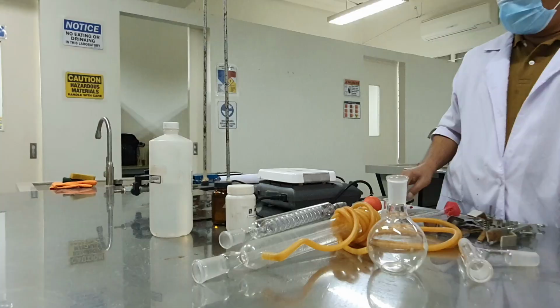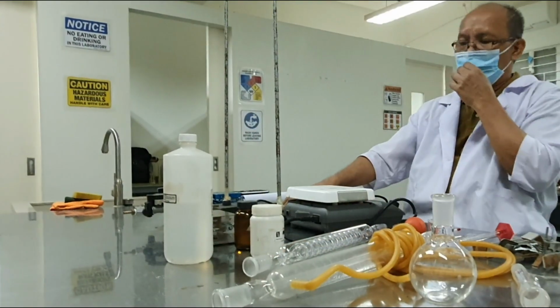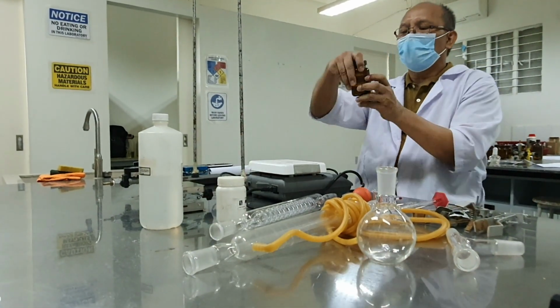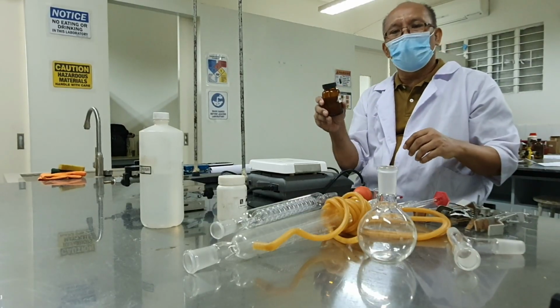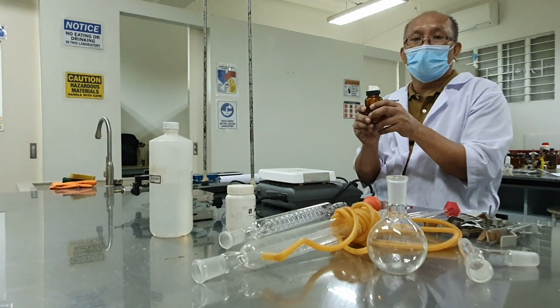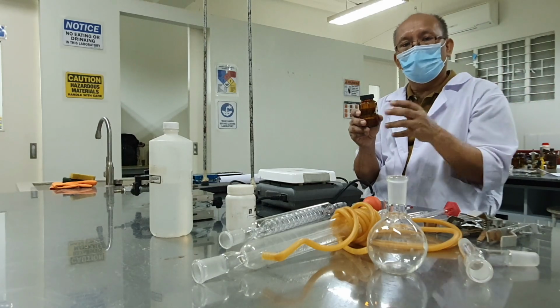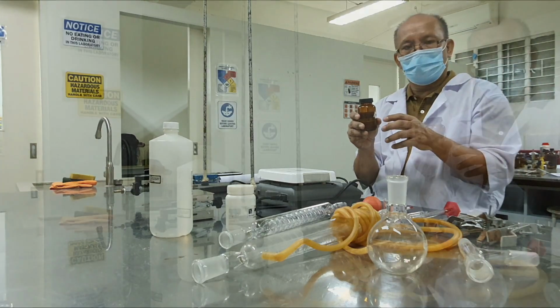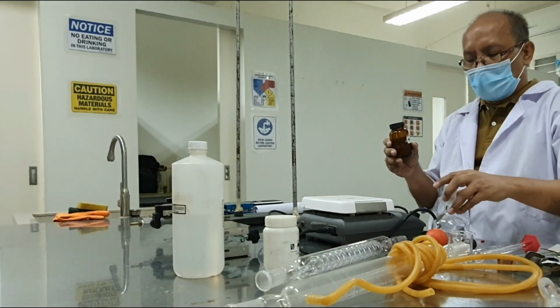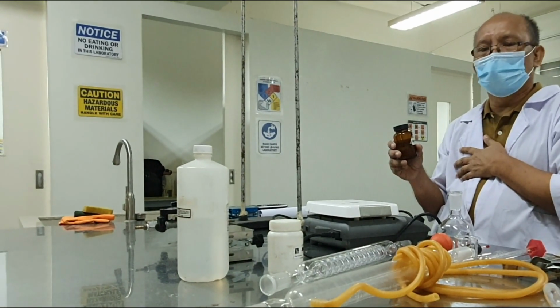To do the setup, you need the iron stand. Here we're going to use a mixture of methanol and butanol. Now, which one has a higher boiling point? Of course the butanol, because it has a higher molecular weight compared to methanol. So we expect the methanol to come out first, followed by butanol.